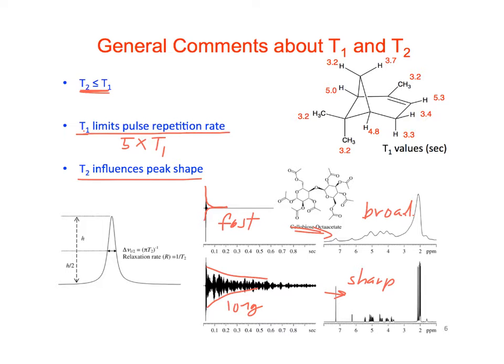Yeah, and the papers I've read change the relaxation rates to just be much faster. Like the pulse time or the... Well, I think changing the pulse width or even the acquisition time doesn't change the process of relaxation, right? It just changes how you're sampling that signal, right? So to get sharper lines, you actually need a slower relaxation process.